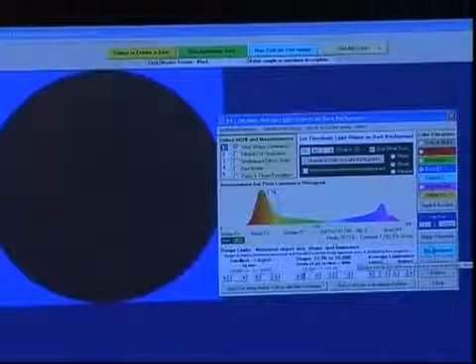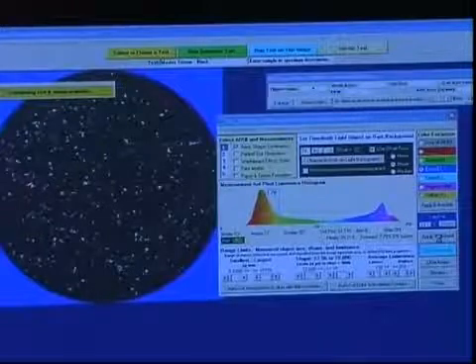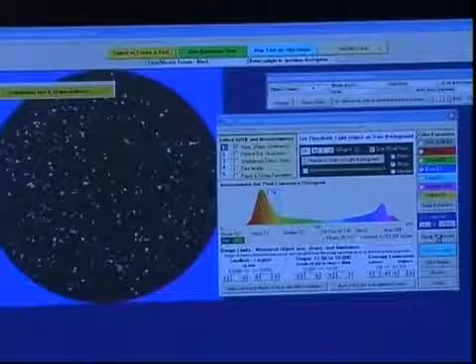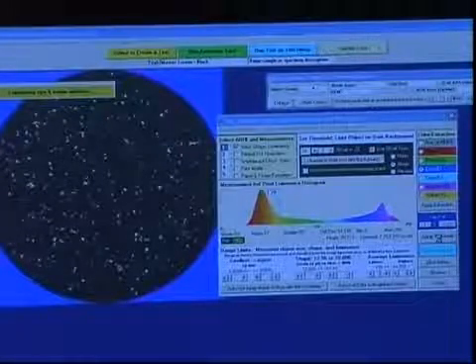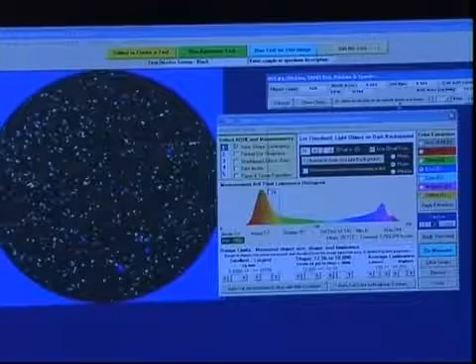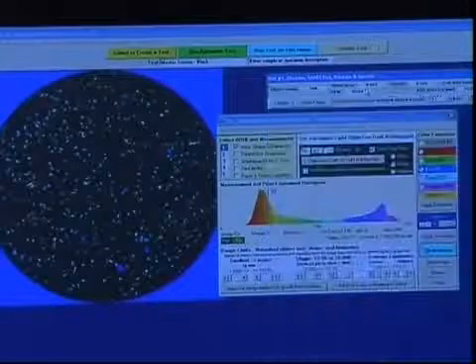And as before, we'll do the measurement very quickly. And it will give us the same report that we had in dirt, a little bit more sophisticated because now we're reporting luminance also. But this is a big, busy image. It keeps a computer very busy, so it takes a while to calculate. And we can pull this report down, and you have the same detail that you had on the dirt counter, but we're going to be able to do 3 of them.